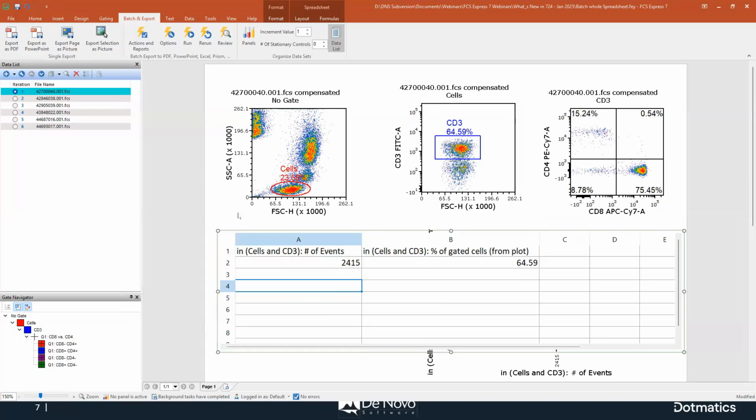Again, if you go back, file options, statistic naming option, you can change this. So for example, you can move this section. Instead of prepending, you can append it, so it will be moved to the end of the name. But anyway, at least the default setting is a bit more user-friendly, I would say.